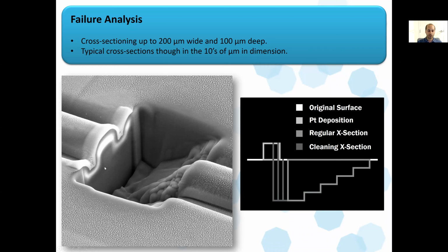You produce some sort of device, and now you want to see, is what I produced actually there? In this example, which is what is typically done, we will deposit a strip of platinum down before we do the cutting.